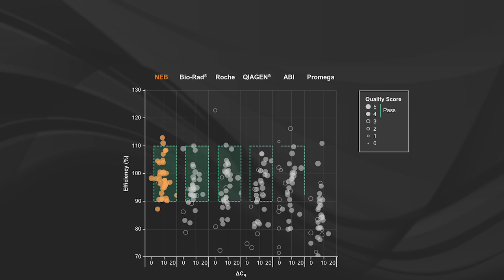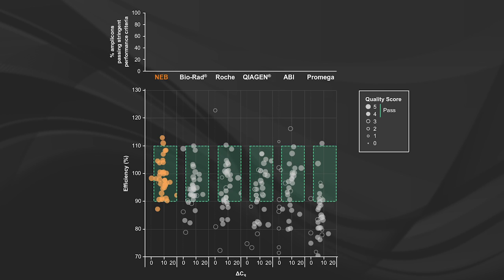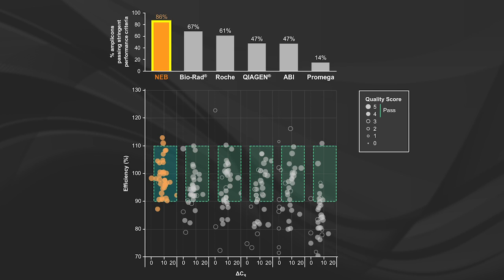Across these 36 experiments, we see the strong performance of the Luna mix where 86% of the experiments yielded high quality results that fall in the box.